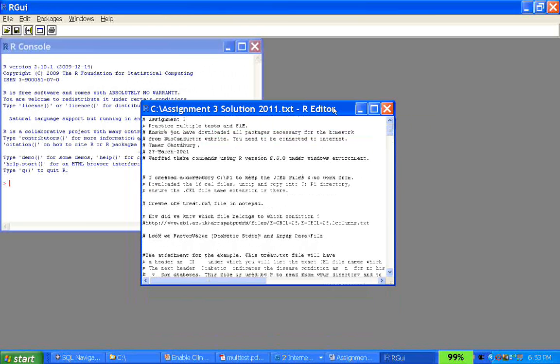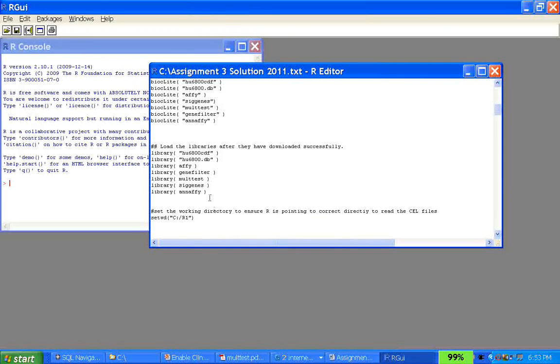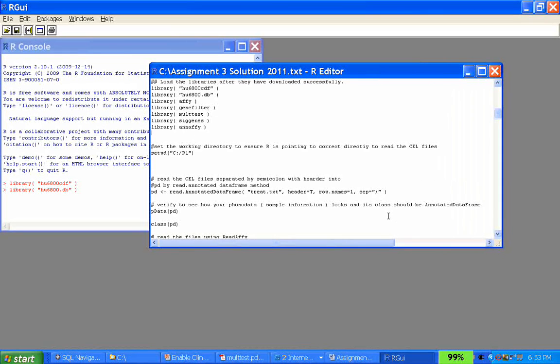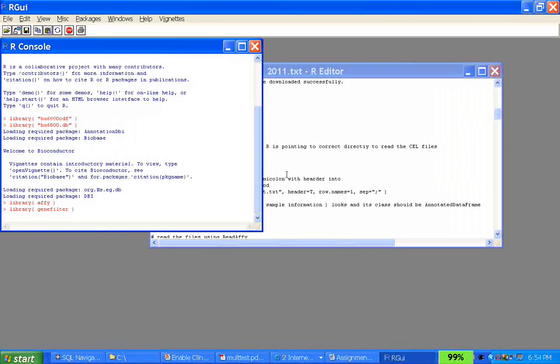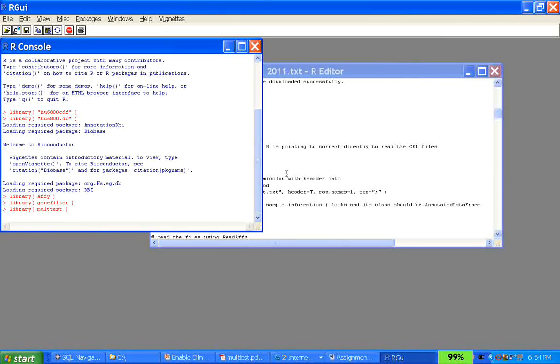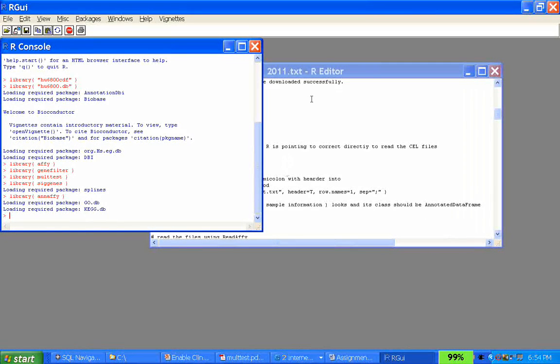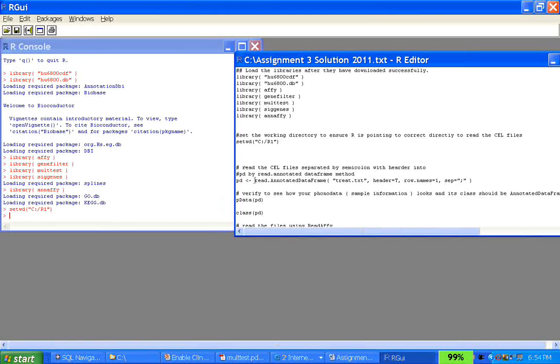Okay, so what we're going to do, very quick. Good to see it again anyway. So get the libraries. Okay, so let's get our directory set. All the CEL files are there.